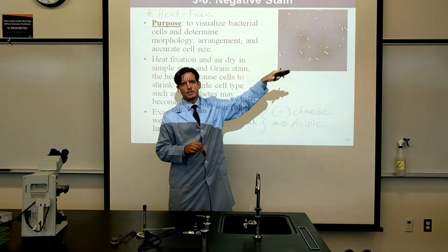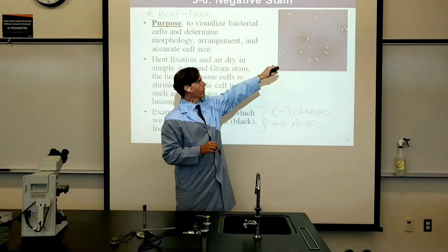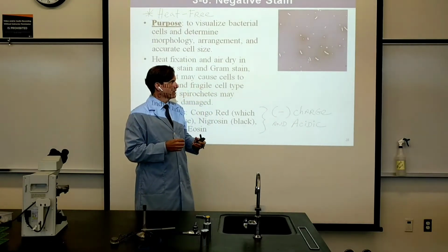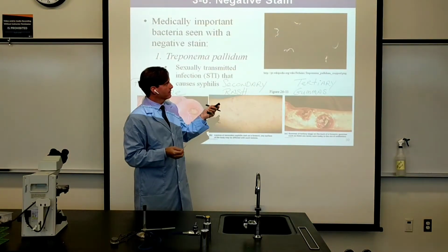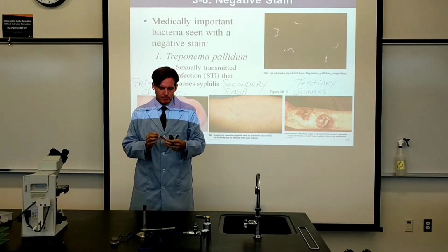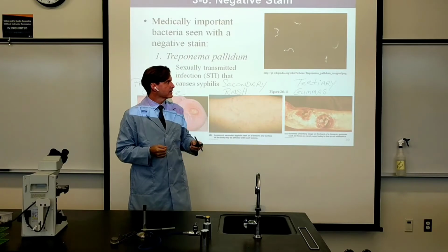Keep in mind that the bacteria are going to be either rod-shaped or spherical, so they'll have fairly regular looking shapes. Occasionally though, if you get lucky or you find something a bit unusual, you might end up seeing these rarer spirochetes that sometimes appear in people's oral cavities in a negative stain sample like this.